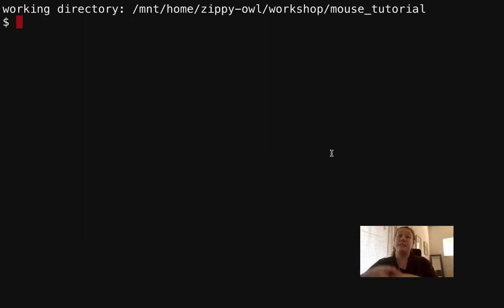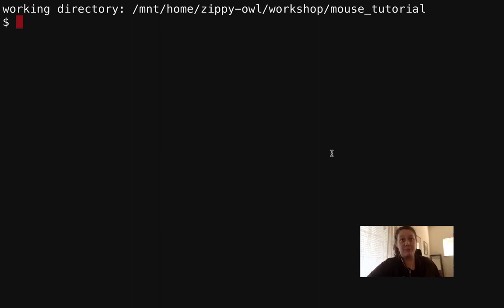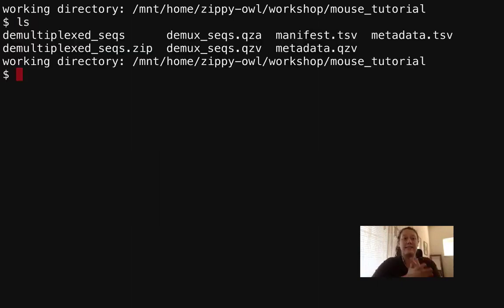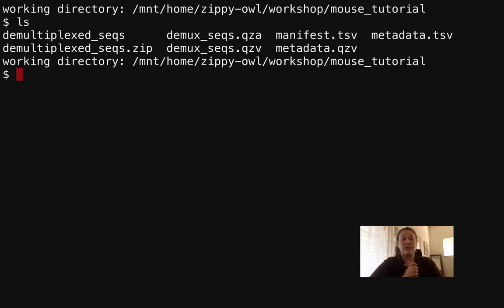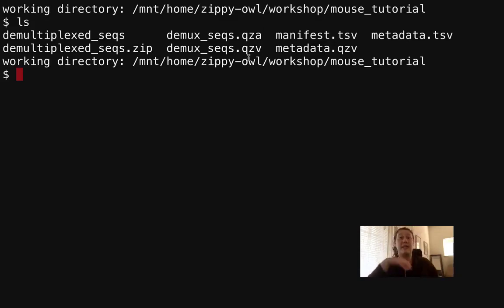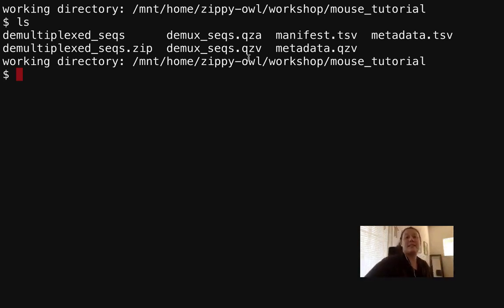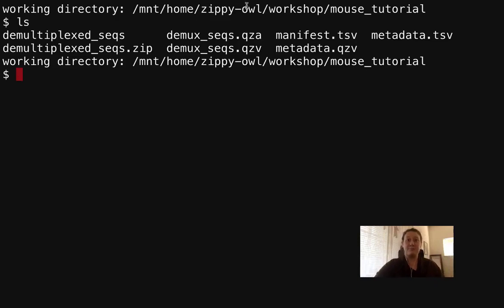The first step of denoising is actually figuring out where to truncate using that visualization. So let's make sure that everyone has that. First I'm just going to ls in my working directory of the mouse tutorial, and you should see this qzv visualization. If you don't, then maybe you should return to the importing and demuxing part of the tutorial.